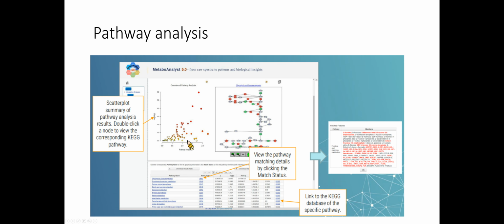MetaboAnalyst also supports pathway analysis in a simple, clear interface. In the pathway analysis results, the disturbed KEGG pathways and the affected metabolites in those pathways will be shown. A link to the KEGG database of a specific pathway will also be provided.